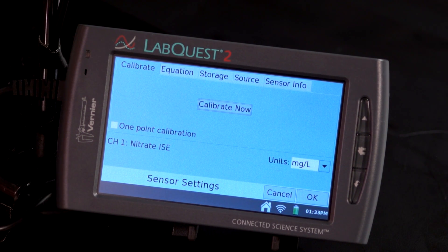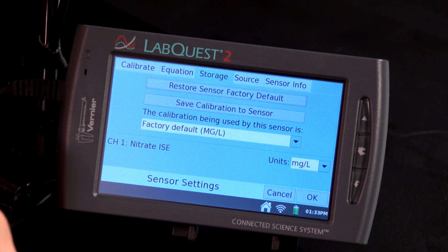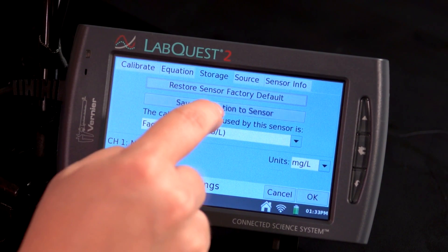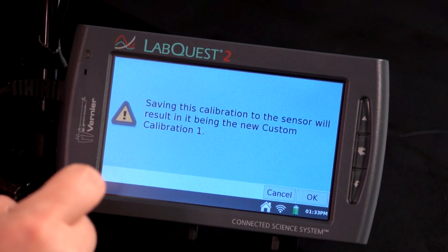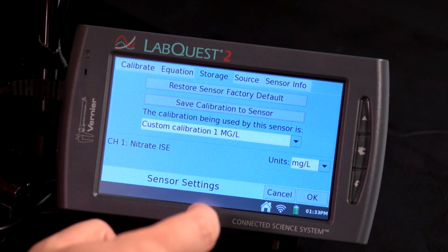To save this custom calibration onto your sensor, tap on the Storage tab. Choose Save Calibration to Sensor. Then tap on OK, and tap on OK again to complete this process.